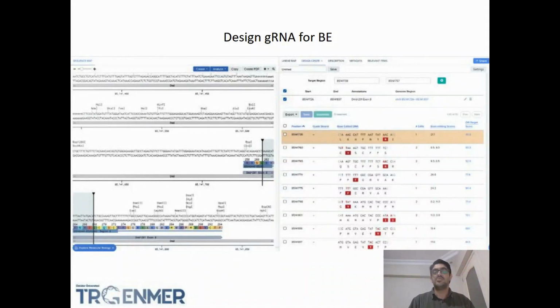This shows how you can change the nucleotides to get new amino acids. This is useful not only for human cells, but also for plant and other animal cells, because if you want to produce targeted mutagenesis, this kind of technology might be useful to increase mutations or the capacity of the physiology or function of the protein.